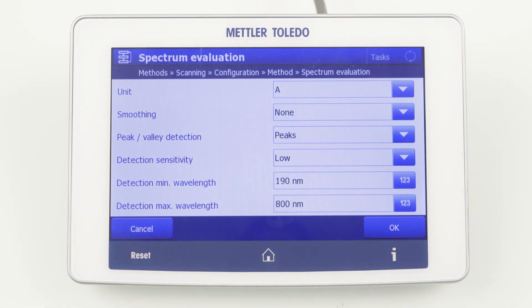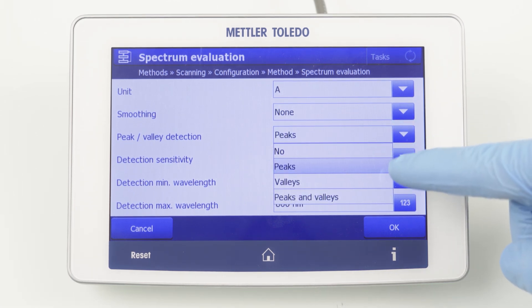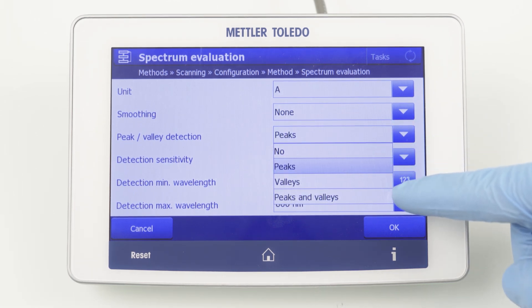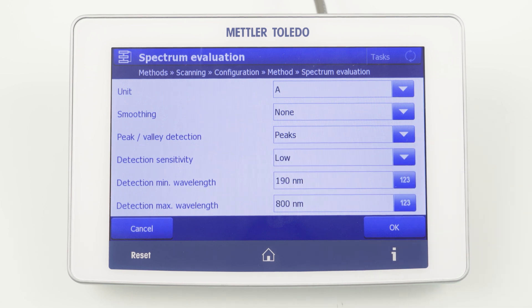You can select whether peaks, valleys, or both should be identified. As we are measuring an absorbance spectrum and figuring out where the peak maximum is, we can select peaks. Valleys are more interesting for a transmittance spectrum.